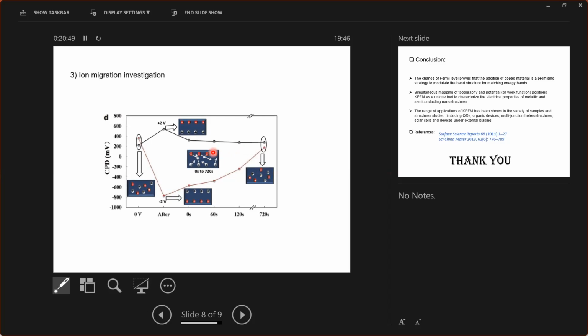Okay. Fix a point, vary the time. Fix another point, vary the time. One can do it, definitely.